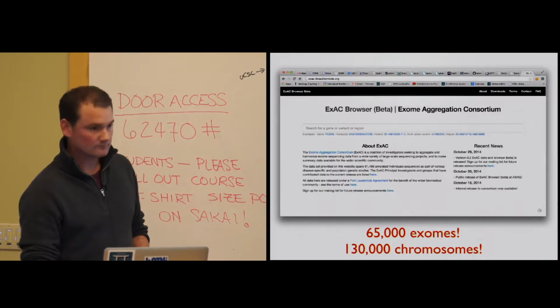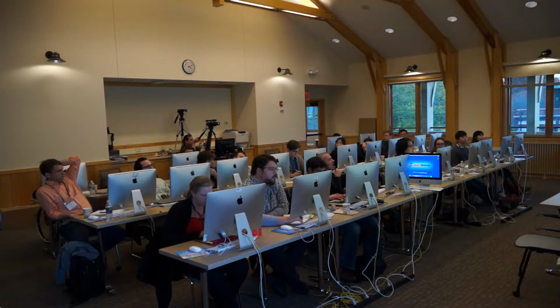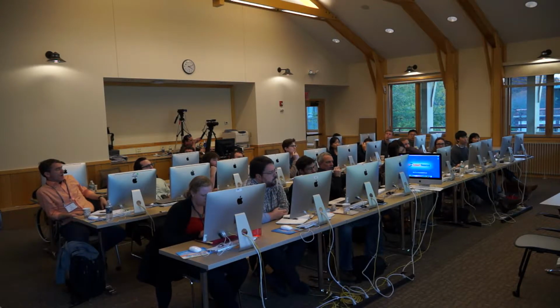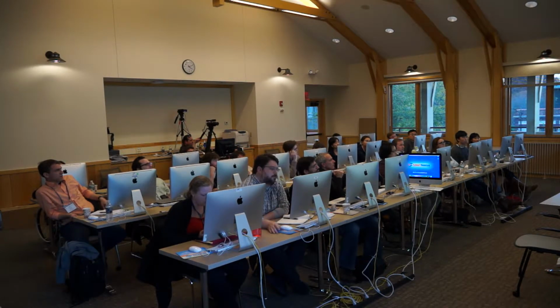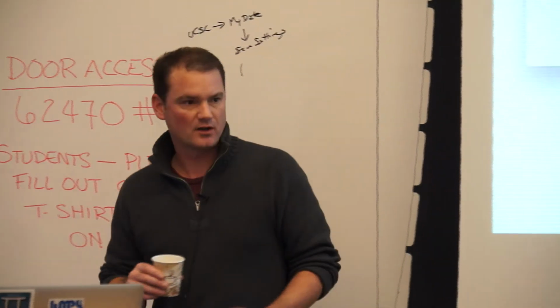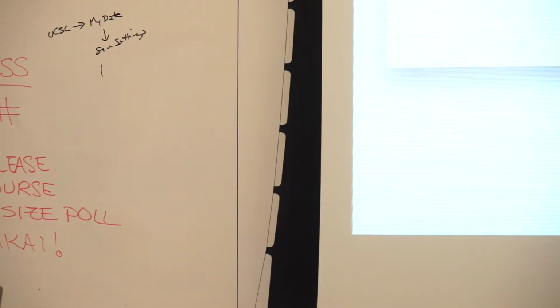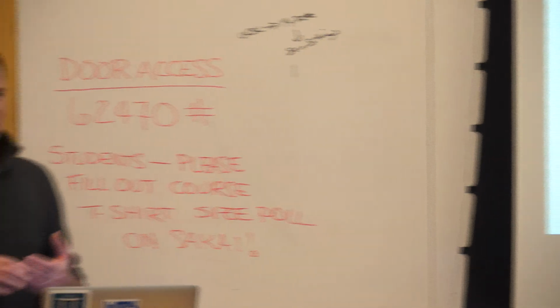So, on the basis of these two data points, 6 out of 565, can you estimate how many people you would need to exome sequence before every variant was observed? So that's what this paper that they just submitted gets at, when do we reach the saturation point? I don't know what the answer is, but I think that's what they attempt to do in that paper. It's on bioRxiv. So that's kind of a critical question, because you want to know when to stop.